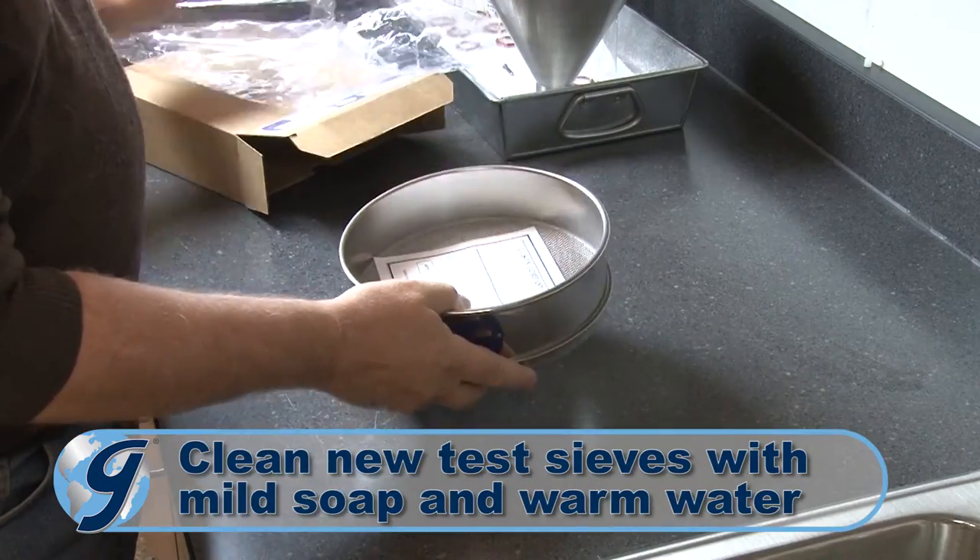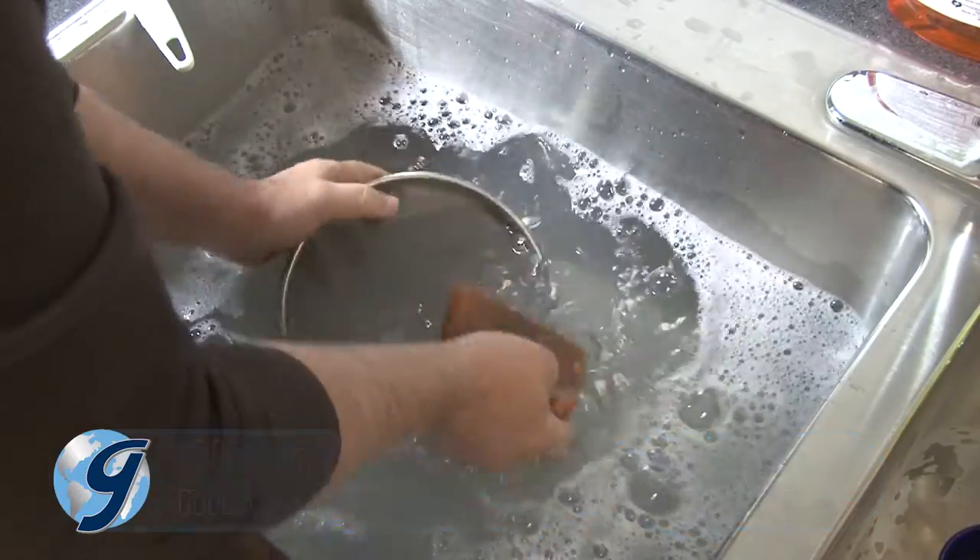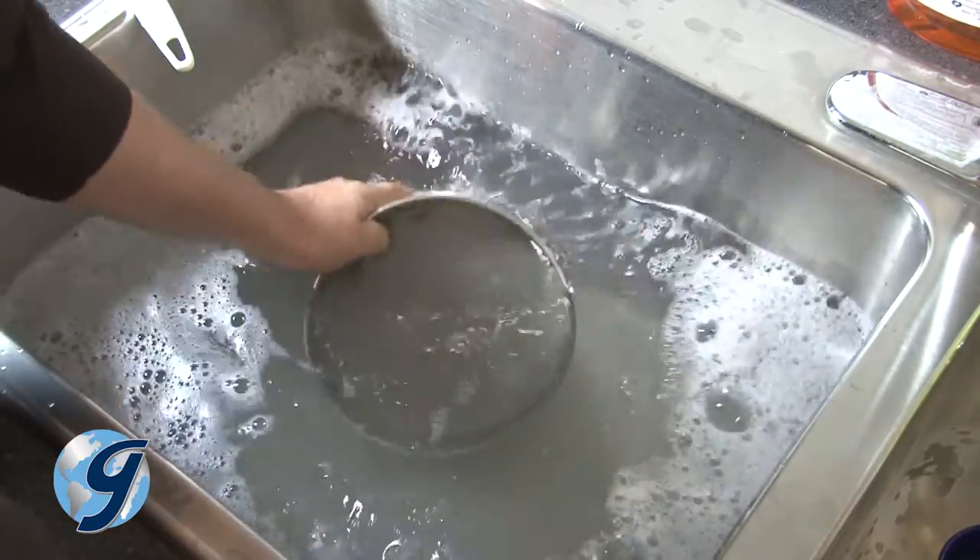First, clean new test sieves using mild soap and warm water to remove grease and oil prior to conducting any tests.